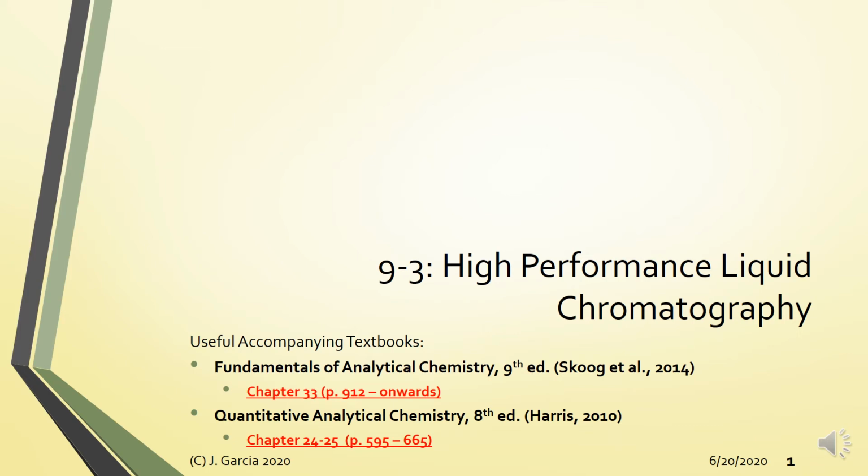This is part 3 of Module 9. For this part of the lecture, we will be discussing high-performance liquid chromatography. So again, take note of the corresponding pages in the accompanying textbooks on HPLC.